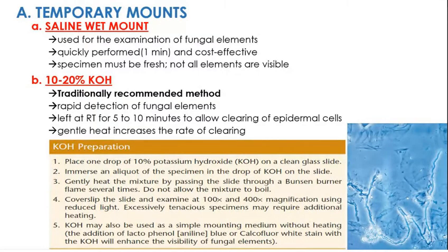So, sa saline mount, obvious reasons, pag sabi mong saline mount, ang ginagamit mo lang doon na mounting agent is just your saline. The disadvantage of this is, di ba, ang contrast niyan na ipoproduce sa microscope is very low so that ang hirap mag-identify ngayon ng fungal elements.